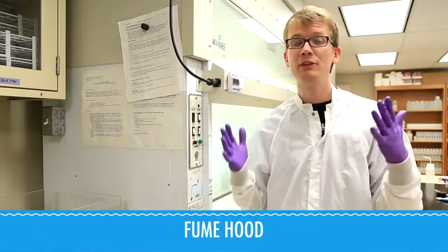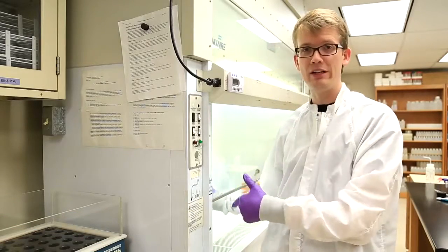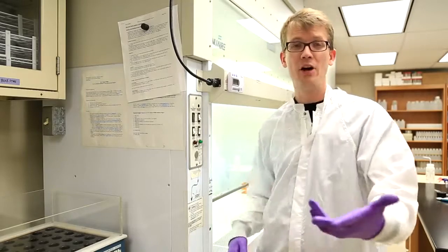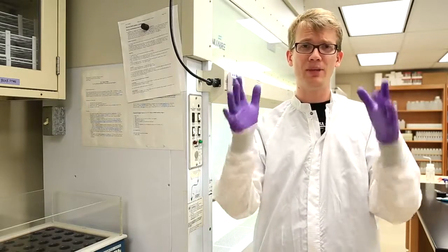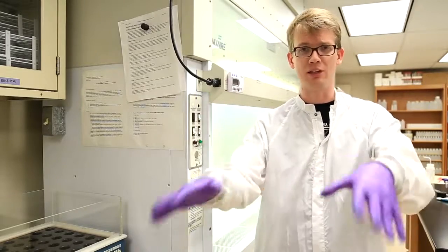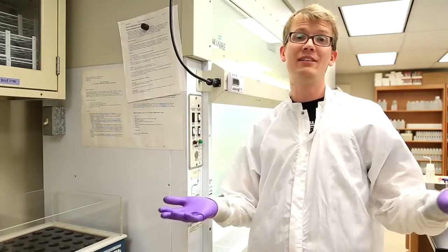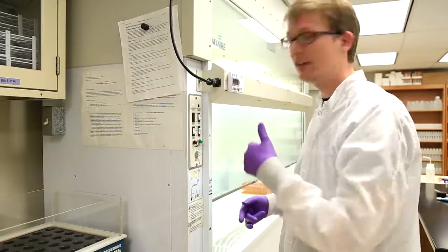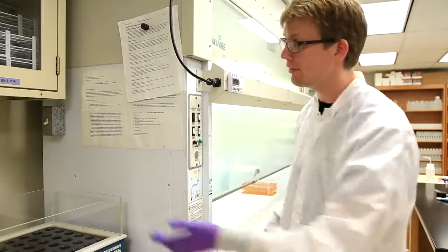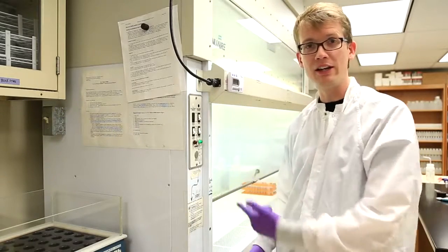This baby here is a fume hood. It sucks all the air in there out so you don't have to breathe whatever's going on in there. It's also why it's impossible to keep chemistry labs at the proper temperature, because the AC units and heating units are constantly pumping in controlled air, and these are constantly sucking it out. So if you're doing some chemistry that might contain some noxious fumes, that goes on in here. And if you want it to work properly, first you gotta turn it on. That's the vent, that's the blower. Now it is sucking air.